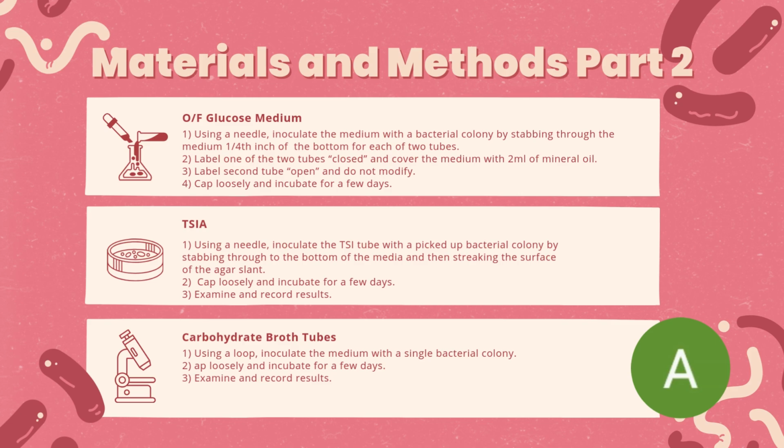Lastly, the carbohydrate fermentation tests call for using a loop to inoculate the medium with a single bacterial colony. The tubes will be capped loosely and incubated for a few days before examining and recording results.